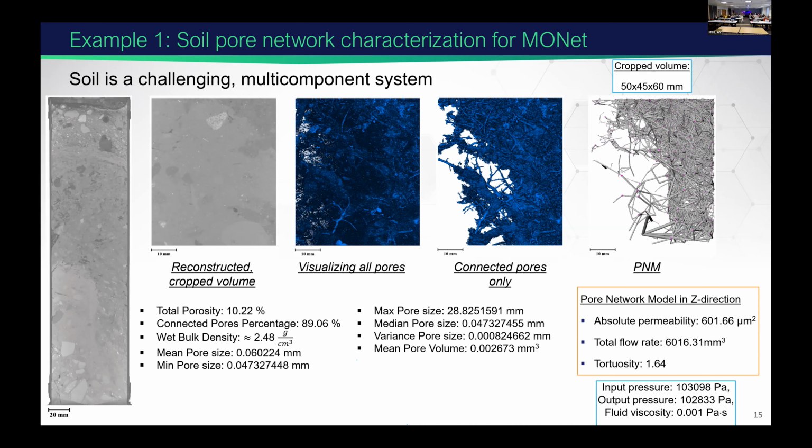And then from higher resolution data, in addition to the 2D slices, we can provide images of the pore network, total porosity, connected pores only, and those are also modeled using a pore network model. And numerically, we can provide not just total porosity, but volume, surface area, and diameter of every pore, each and every pore. And one can do further analysis on those pore spreadsheets. And then using the pore network model, as we'll describe also in the data tutorial in detail, we can derive flow and transport quantities or parameters.